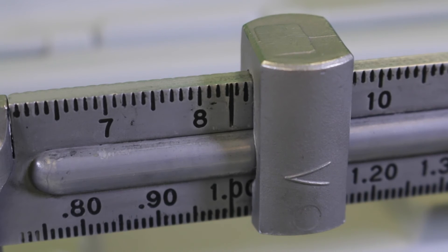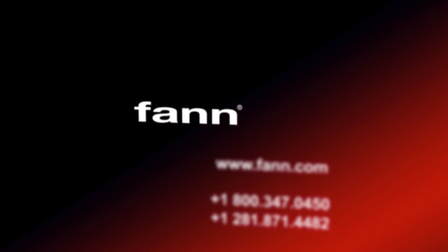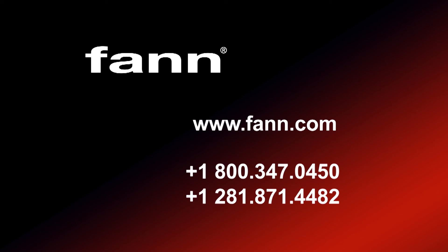If the mud balance does not give the correct reading for fresh water, the instrument should be thoroughly cleaned. For more information about the Model 140 Mud Balance, contact Fann Instrument Company online or by phone.